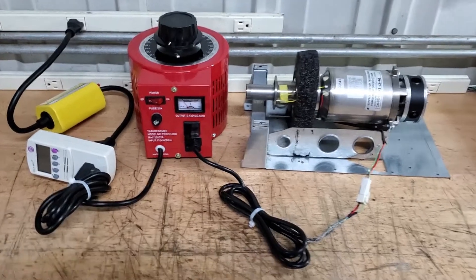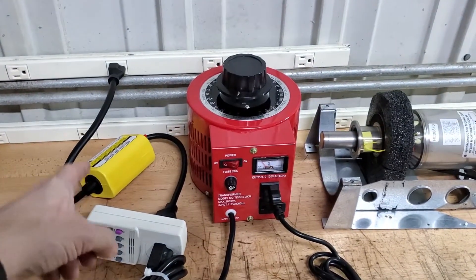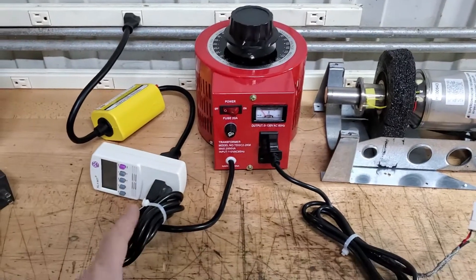This is the setup you'll be getting. The yellow box will plug into the wall, and the wattage meter will plug into that.